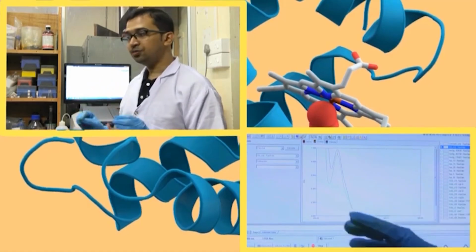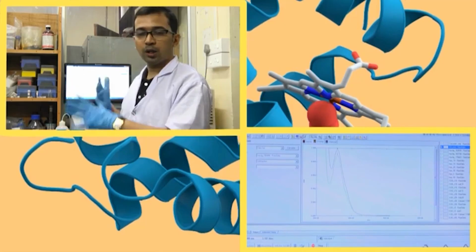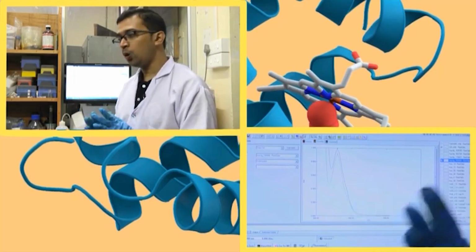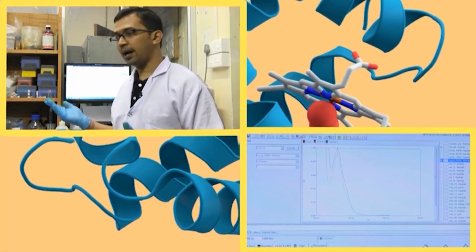Okay. Now, suppose we do the curcumin experiment in one day and we do this gallic acid experiment on a second day. So, for each and every day make sure to take the control separately. Okay. But if you are doing it at a stretch, you can carry on, but it is always better to do it separately.